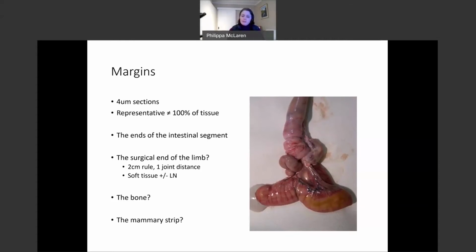Some things like soft tissue sarcomas will tend to have tendrils penetrating through, and those can work their way up along the fascial planes. So we do try and take surgical margins when they seem relevant. We'll always try and find the lymph node, but that can be quite challenging. And depending on your need to create a skin flap to close the wound, you might have taken that node already. If you find it, incidentally, while you're cutting the leg off, then send it in a separate pot.